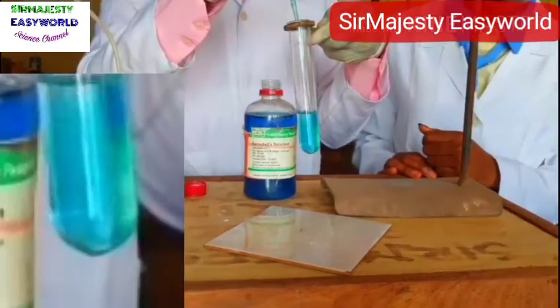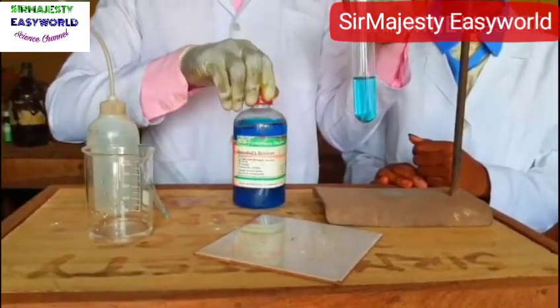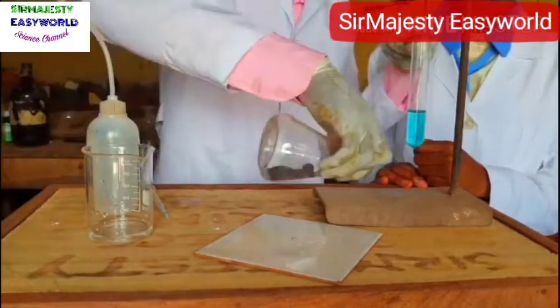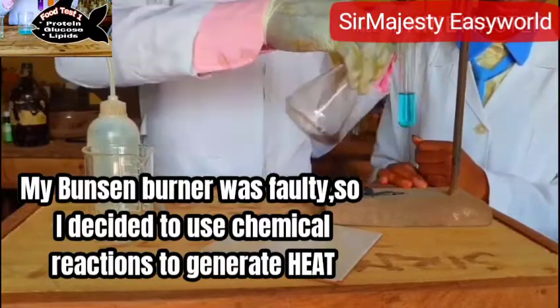So what do you do? You add a few drops of Benedict's solution to the sample. And do what? And warm gently. We lack a heat source so we use a chemical reaction to generate the heat needed.